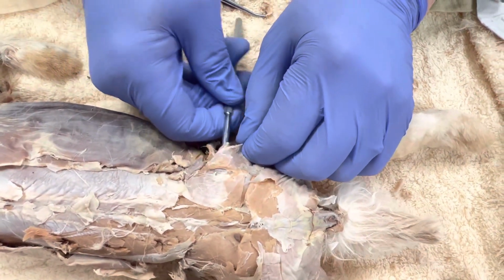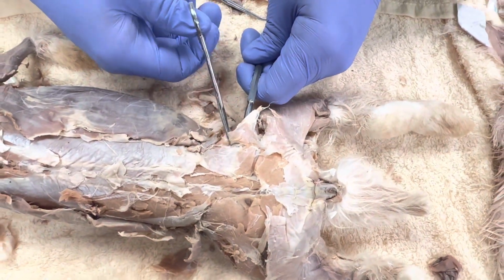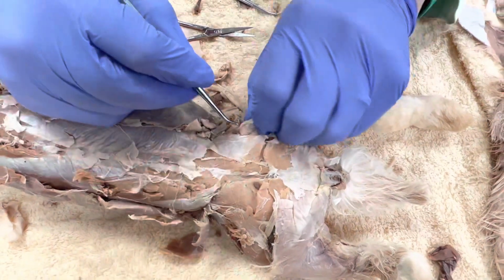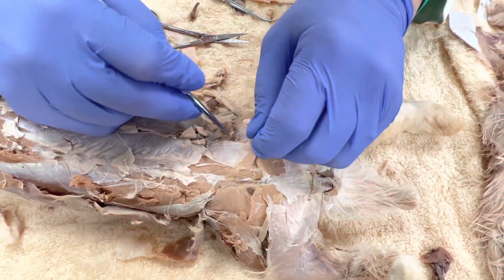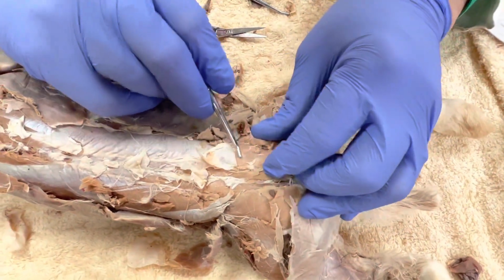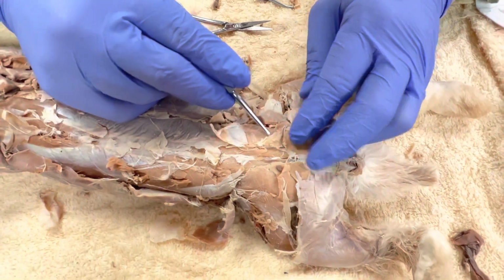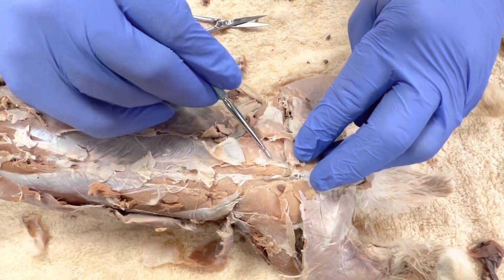And then if I were to cut this real quick, I have my, ooh, I cut a little bit too much. I cut too much, so let me see if I can catch part of it. I would have my, there it is. So this is going to be my Gluteus Maximus, would be this thin muscle that's right here, and I got some of it cut away, but if I remove that, that's the Gluteus Medius right there.